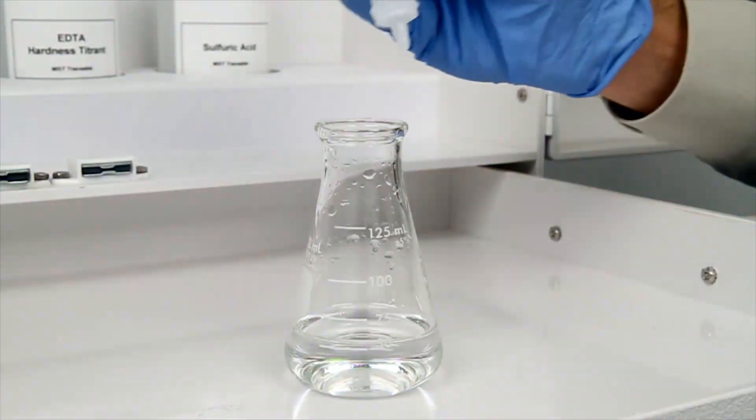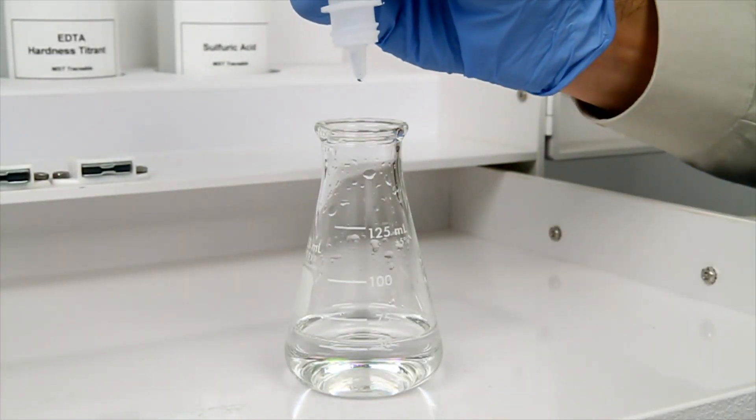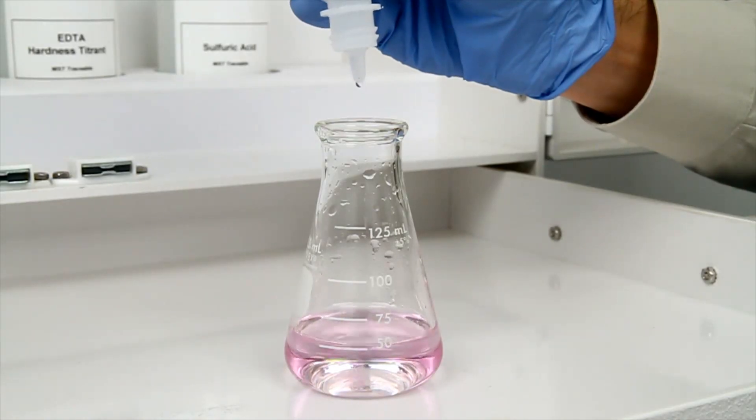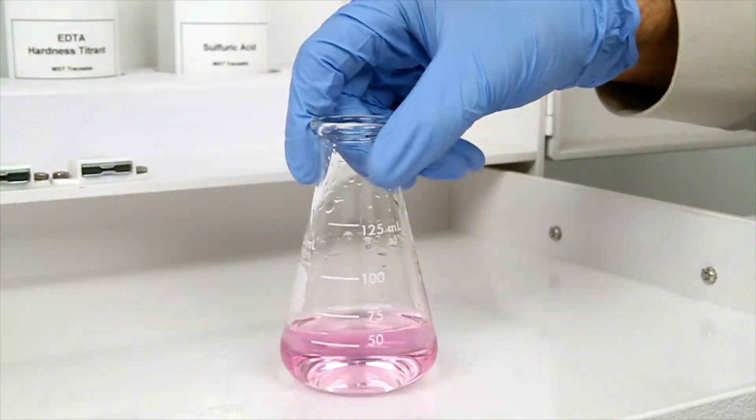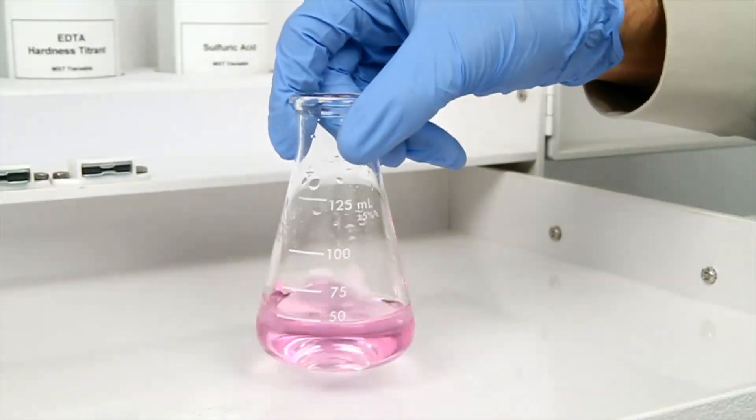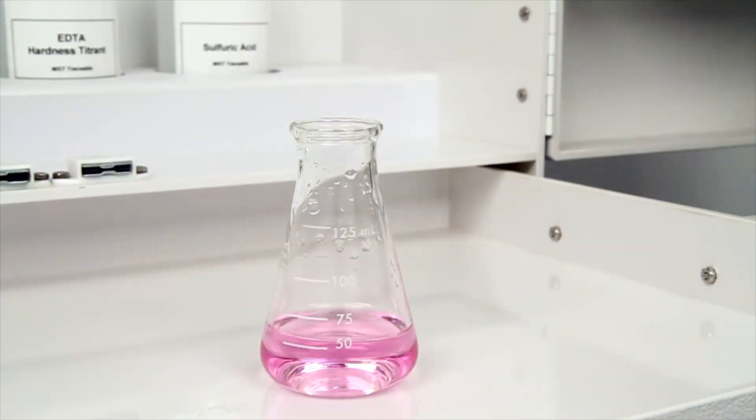The next step is to add five drops of phenolphthalein indicator. After the addition of the reagent, swirl to mix. The solution should turn red. If the solution remains colorless, the P alkalinity is zero.